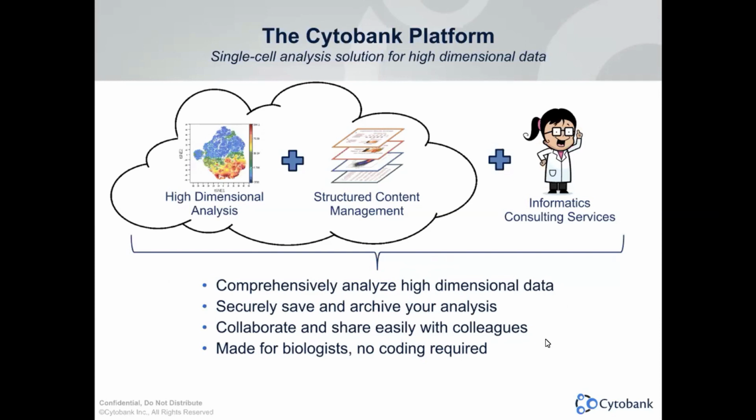You can collaborate and share easily with colleagues too, just by a share button. The platform is designed for biologists. No coding is required to run any of those algorithms. You can also make Cytobank's professional bioinformatics consulting team part of your team for your research project, and we welcome any potential collaborations in that regard.